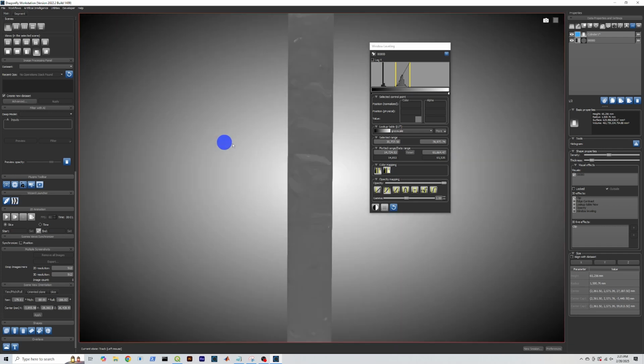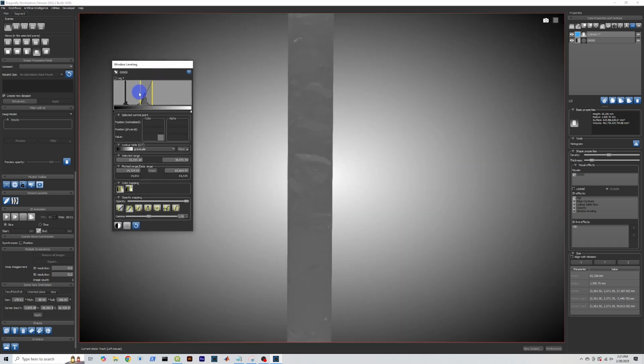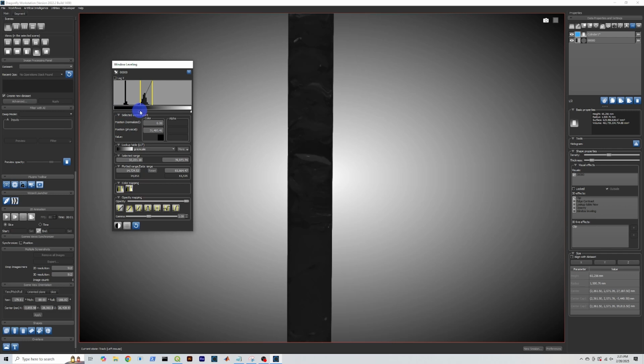So now let's go back to just the three-dimensional view, and we're going to go like this. So this is the opacity mapping, and then this is the color mapping down here when you get to your three-dimensional visualization.